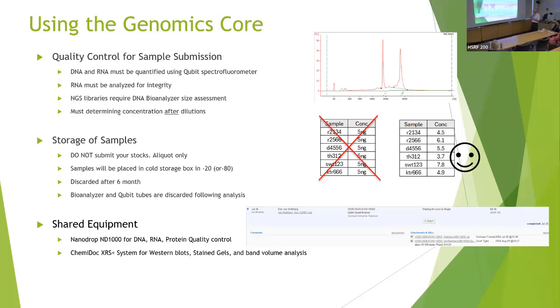A little policy on storage. Don't submit your stocks. Please don't give us the only thing you got, because if a freezer goes down or we throw it away, it's not going to be good. And make sure there's a box with your name on it, the -20 or -80, depending on how they need to be stored. And we'll give you a box if you don't have one.